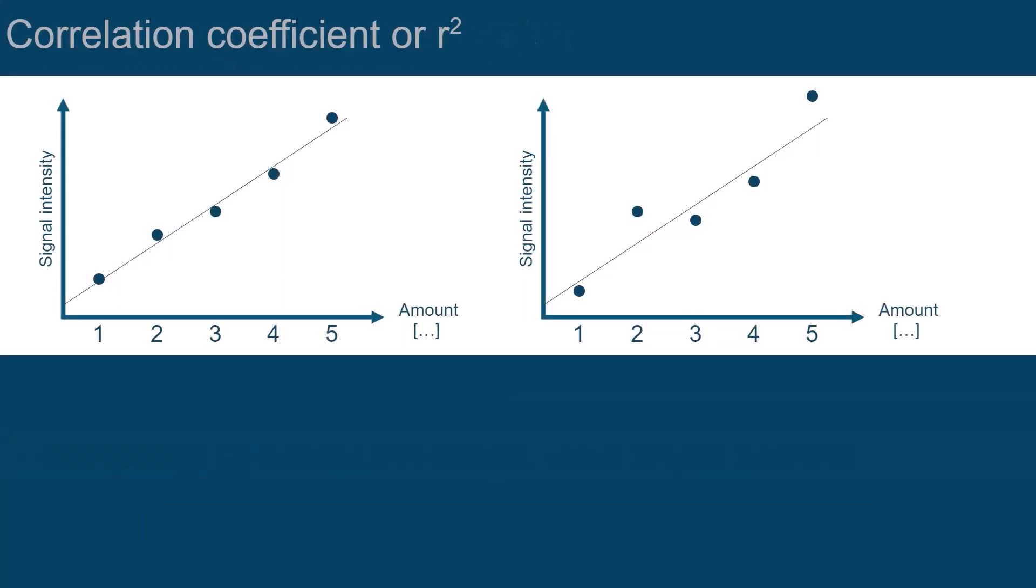Let's have a closer look into these calibration curves. The one on the left has low deviation in the signal intensities, whereas the one on the right shows a high deviation. Everyone may agree that the left curve can be considered as good, and the right one is bad.